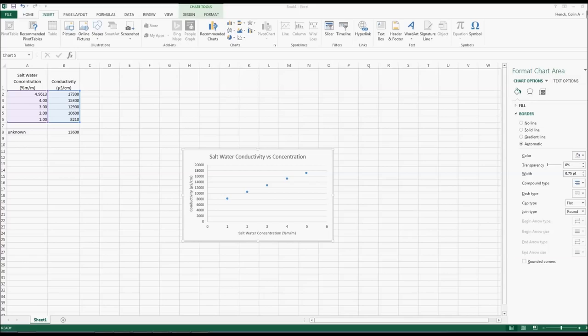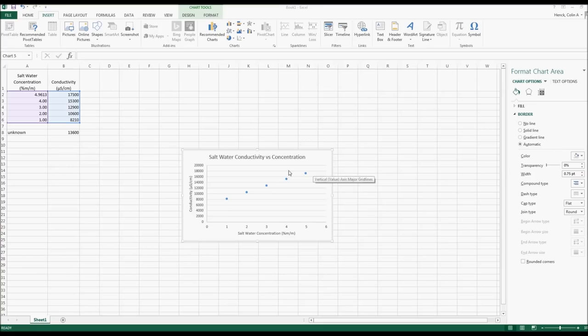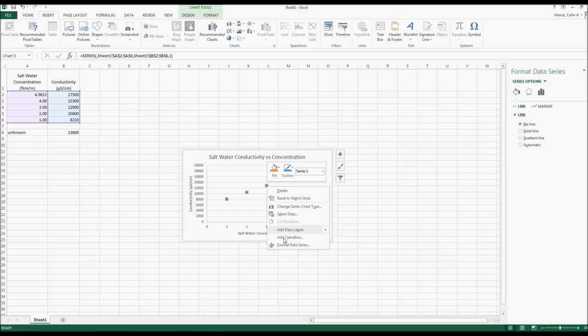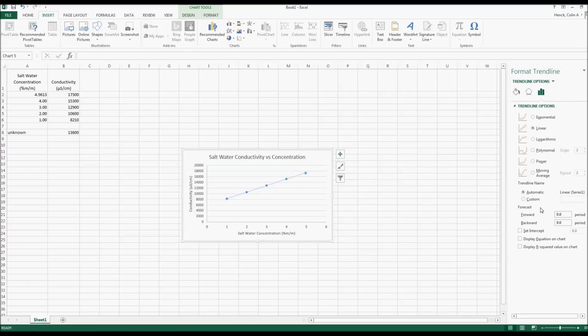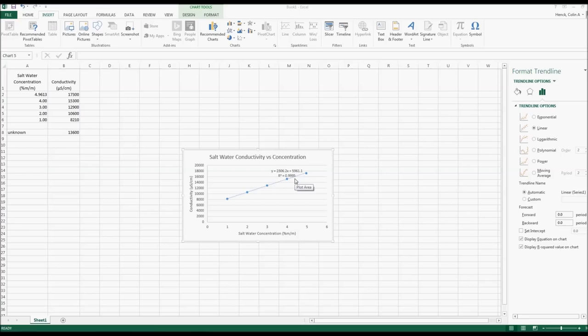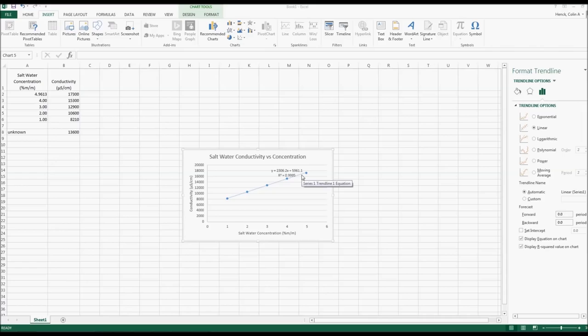Now insert a trend line. Click on one of the data points, right-click and select Add Trendline. Use a linear regression (the default option), and check the boxes to display the equation and R-squared value on the chart. This data has an R-squared of 0.9995, telling us the curve fits the data well and all data points are on the line. Excel gives us the equation of the line, which we can use along with the unknown conductivity (a y-value) to solve for x and determine the concentration of the unknown.